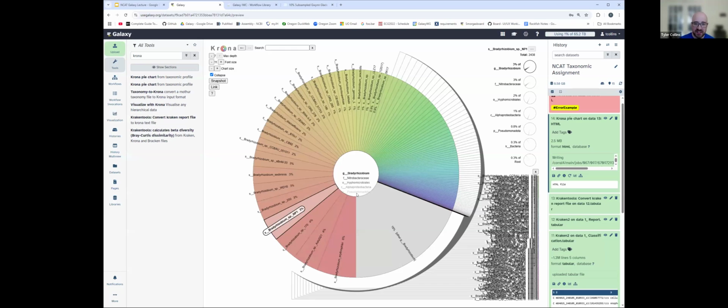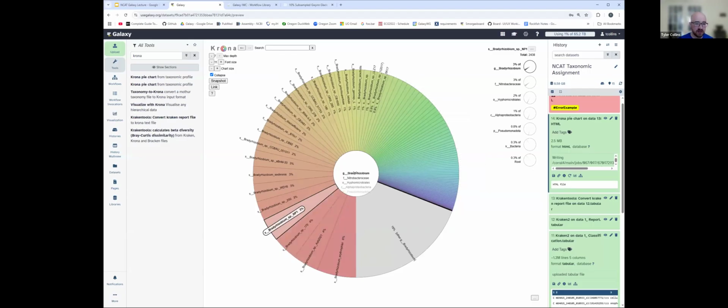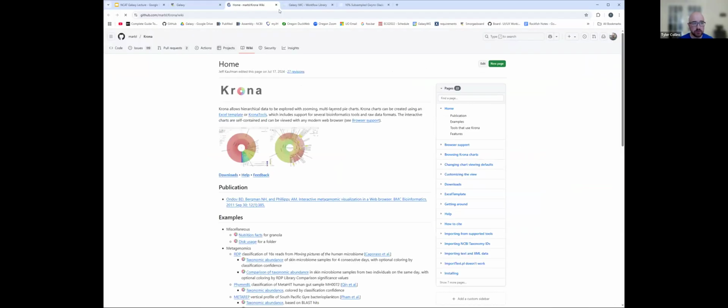If we click on one of the species, we can get an idea here, and we can start to look and see what's closely related, what percent of the total it made up, what the differences are. I'll close that for the moment. Very often what can be useful here is if there's some kind of bacteria we're specifically interested in, or something we want to particularly find, we can investigate it. I'd encourage everyone, if you want to, mess around with this chart, especially if you pulled in the history, look around, and see if you find any interesting bacteria.